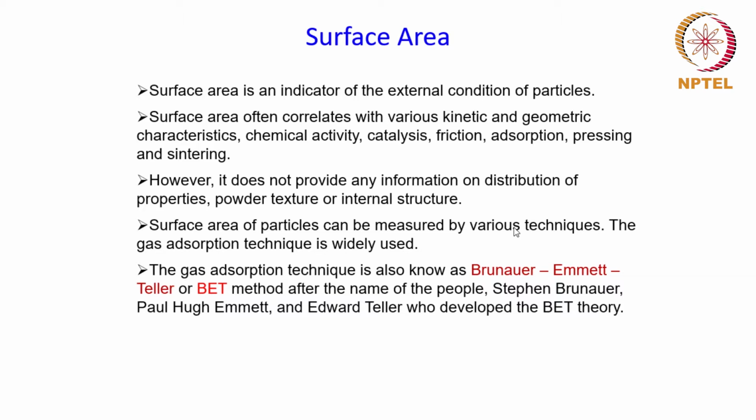Now, when it comes to measuring surface area, there are various techniques which can be used to measure it. However, by far the gas adsorption technique is the most widely used. And this gas adsorption technique is also known as the BET method, which stands for Brunauer, Emmett, Teller, after the names of the people who invented this theory.